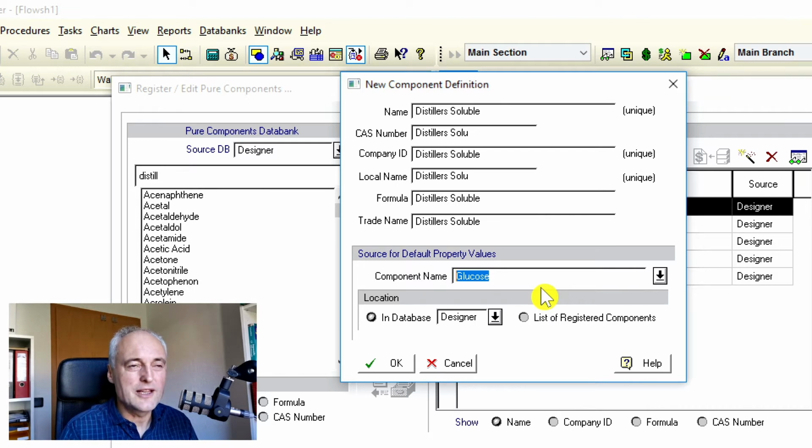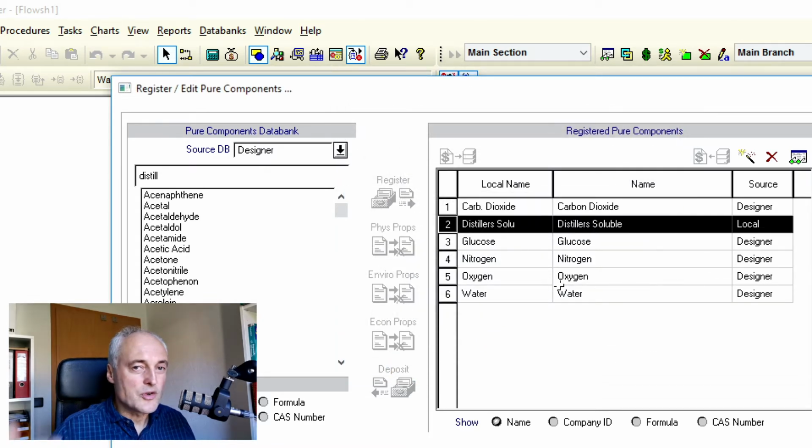With glucose, we already have a COD and so on, so we have many values which are fair with respect to it. It's better than using a salt. It's fair. It's an organic compound, full stop. Then let's start with glucose. Then you don't need to initialize all parameters from scratch. So now we have already something and we say, okay, we're happy. But of course, we keep in mind that this is not the exact composition which is inside of that.